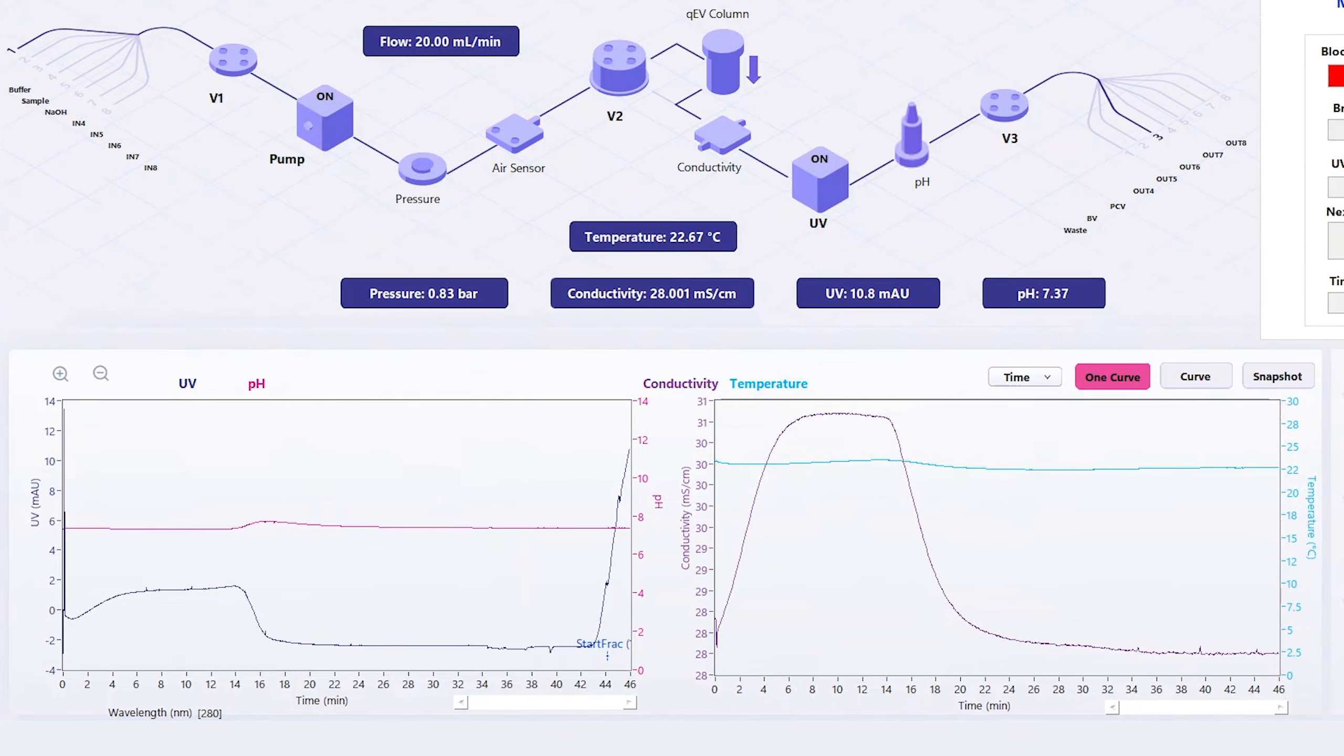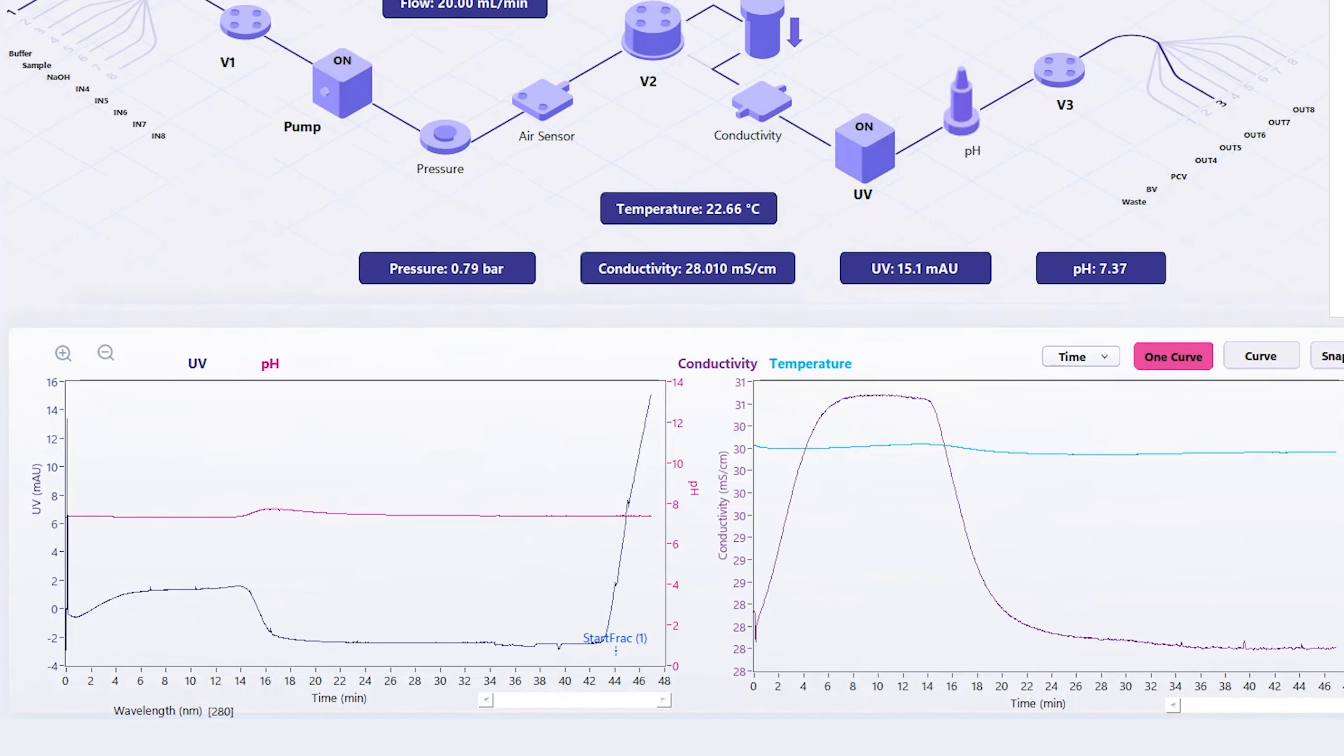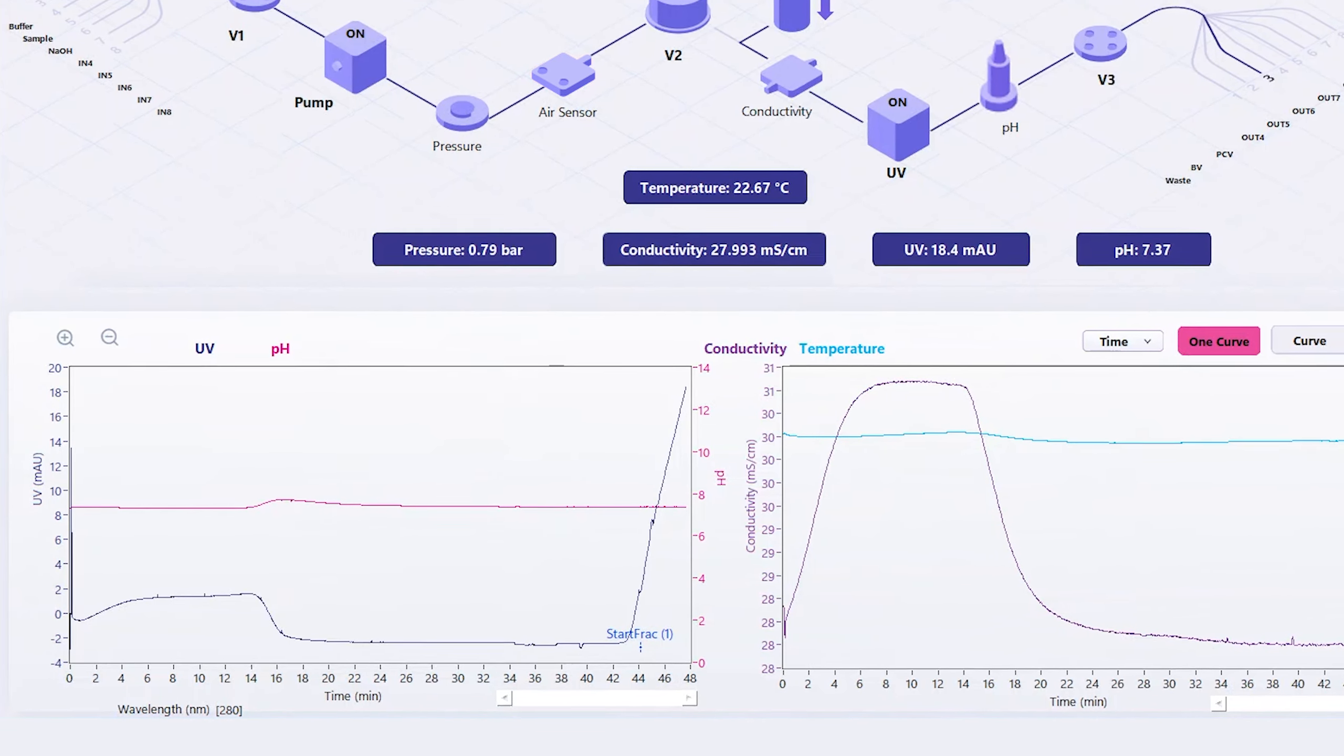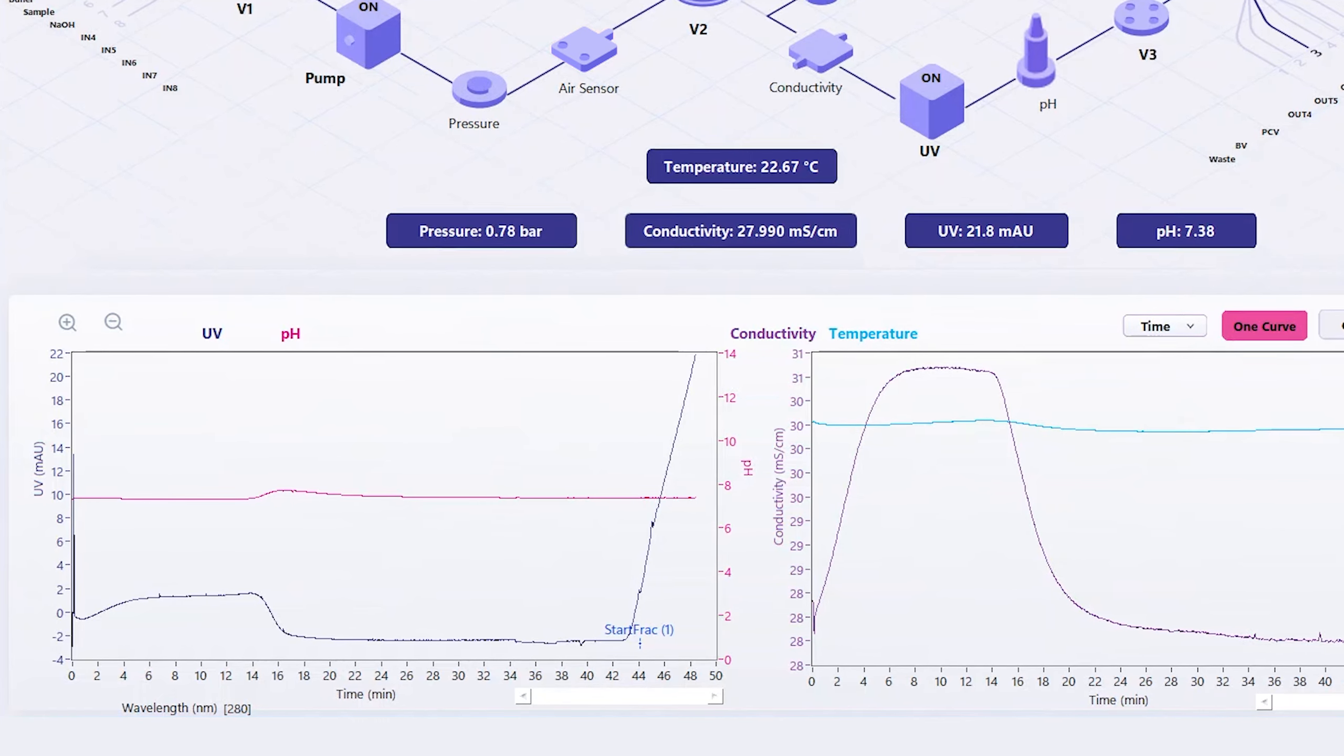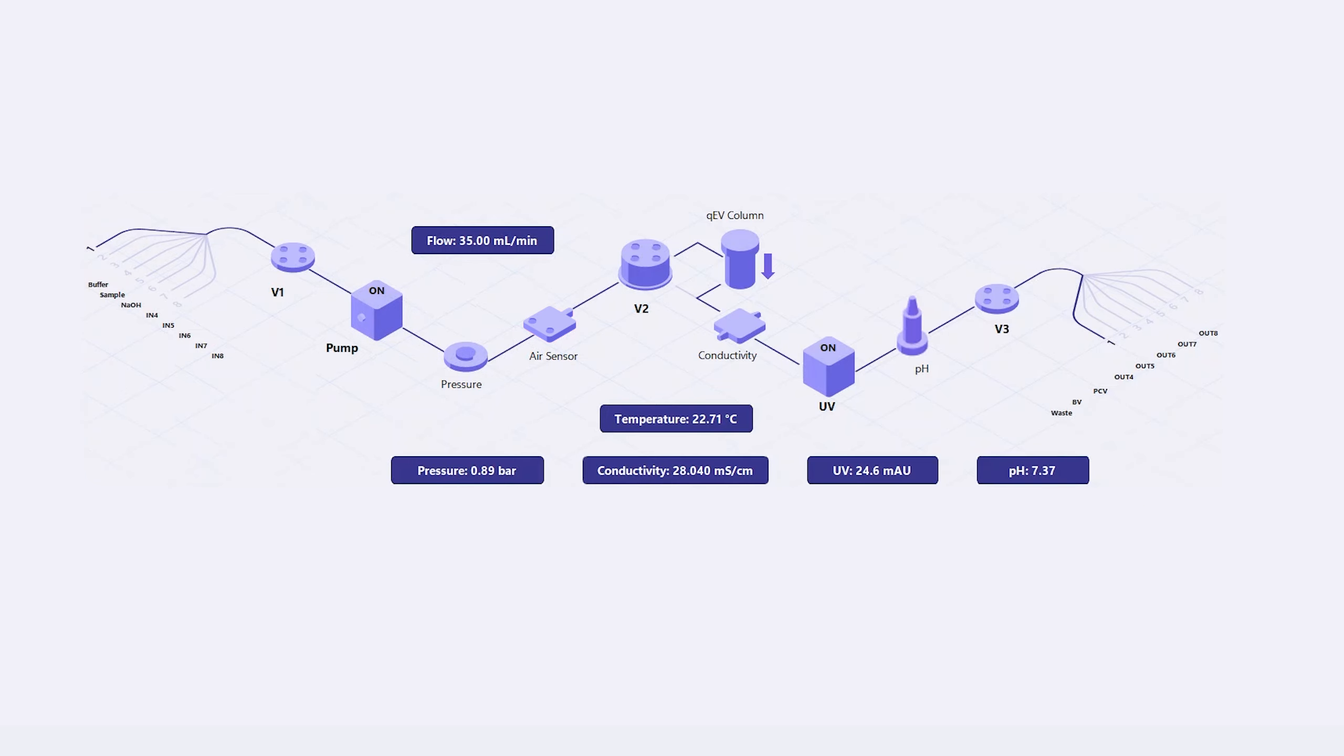In this case, we are isolating extracellular vesicles from plasma, and we have entered our desired purified collection volume in the method setup, based on our analysis of previous elution profiles. The outlet will change from our collection vessel to waste, based on what we established in the method development phase.